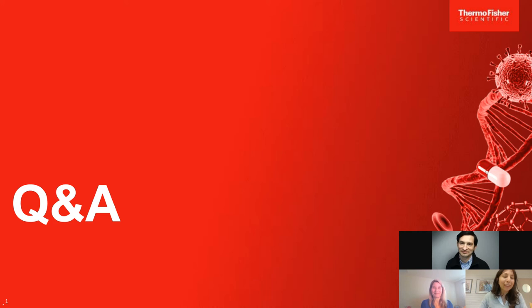It's a good question, because you need to always expect to lose at least half of the lamellas along the way. I'm losing fewer lamellas now, but it's true that you take a risk, whether it's on the FIB milling at the last step of polishing, where you try to have a very thin lamella and you can see that you are really risking cutting through the middle and losing the lamella completely, or during the transfer. Half is really a lot, but something like that.